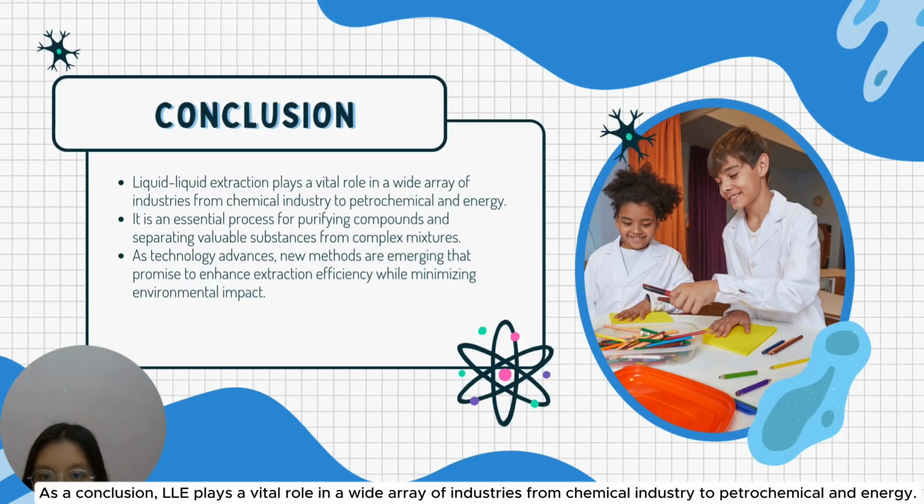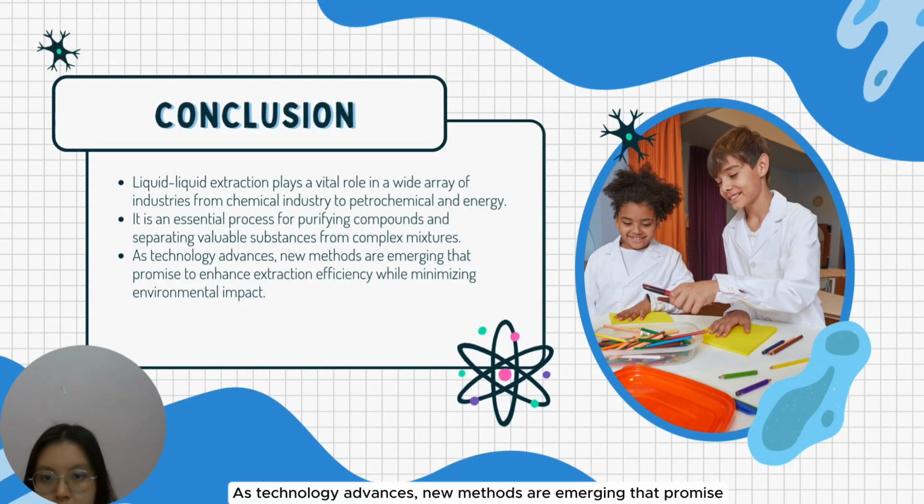As a conclusion, LLE plays a vital role in a wide array of industries from chemical industry to petrochemical and energy. It is an essential process for purifying compounds and separating valuable substances from complex mixtures. As technology advances, new methods are emerging that promise to enhance extraction efficiency while minimizing the environmental impact.